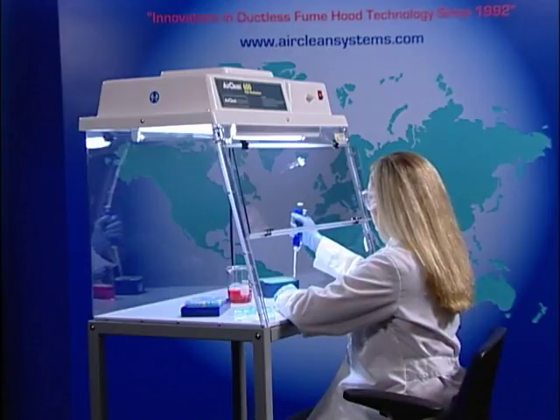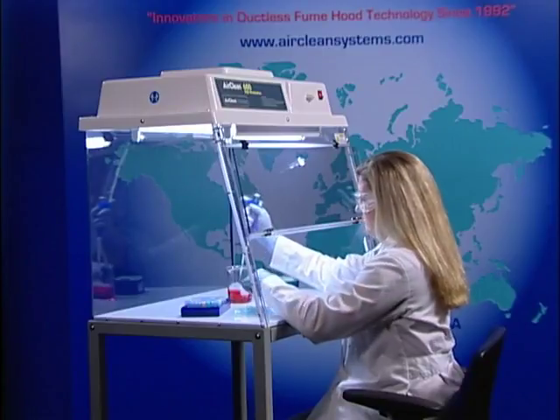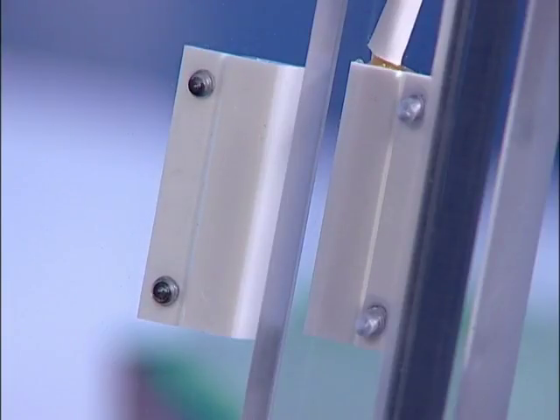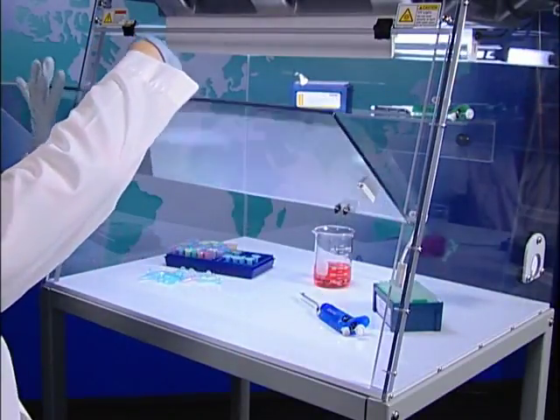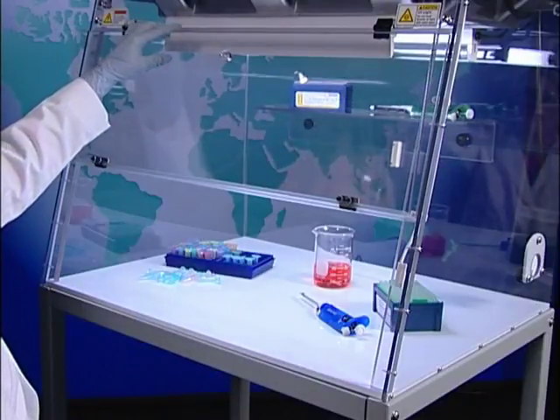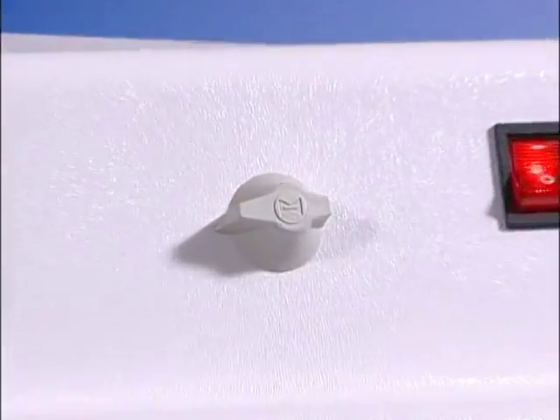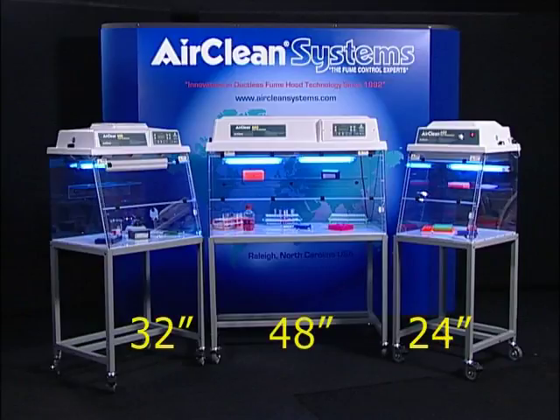The dead air box is constructed completely from UV-resistant materials. Designed with operator safety in mind, the workstation is equipped with a sash safety switch that automatically turns the UV bulb off when the lower sash is opened. When the sash is opened, the fluorescent bulb is illuminated. A mechanical 15-minute timer is standard on each dead air box. AirClean Systems dead air boxes are available in three sizes — 24, 32, and 48-inch width — with a standard depth of 24 inches.